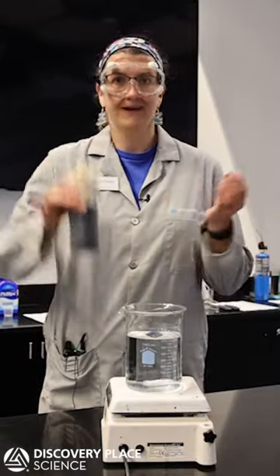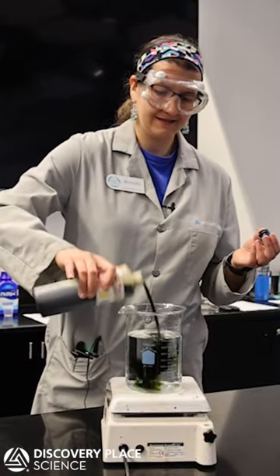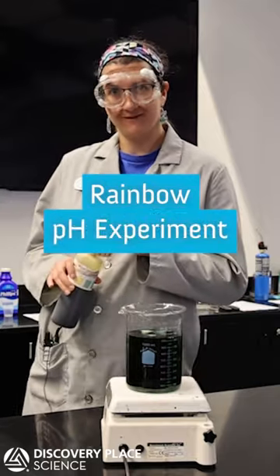Hey everybody, I'm Michelle, and this is the rainbow pH experiment.